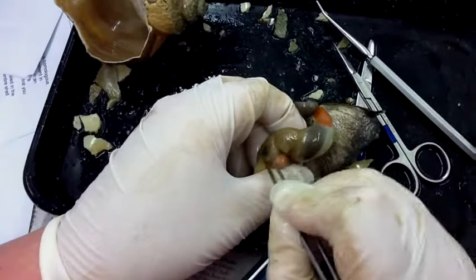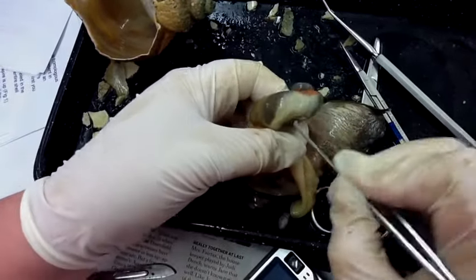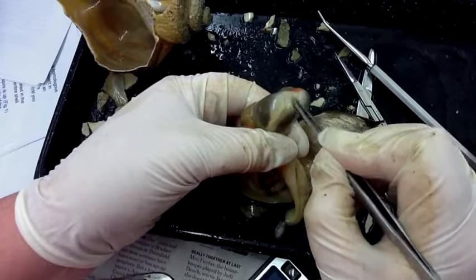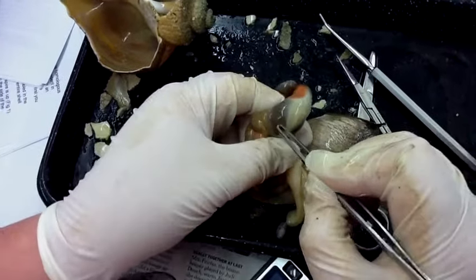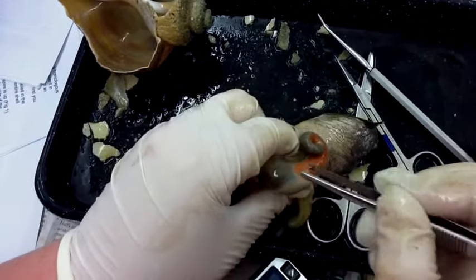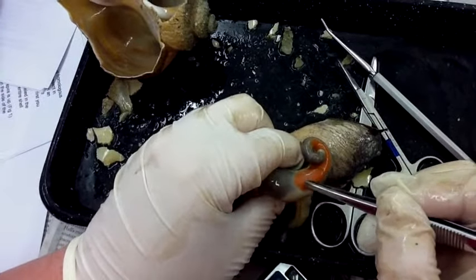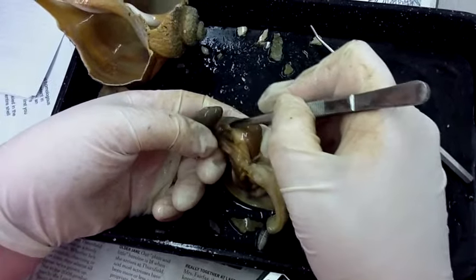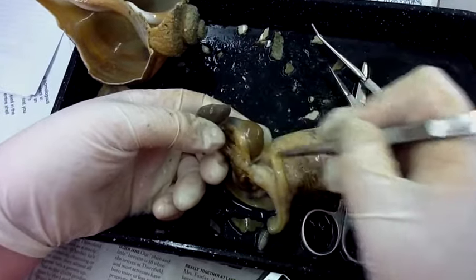This part here is the cecum of the animal. This clear white structure with this conspicuous vein that runs through it is the stomach, and the dark part is the digestive gland running on either side. Up here at the top is the gonad, and because it's male, it has these tubules that will lead down to the penis.